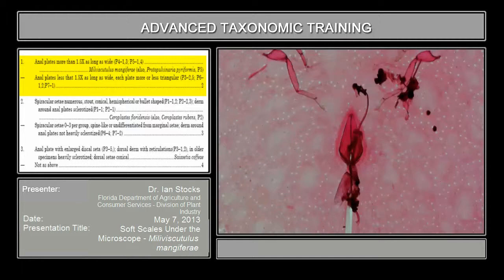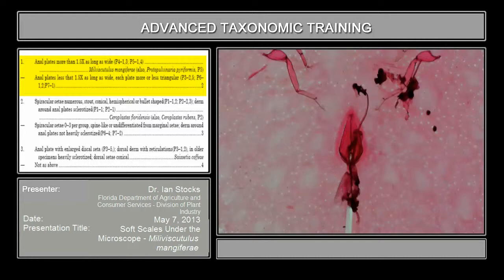The first statement in the key says: anal plates more than one and a half times as long as wide. So for this case, you're going to take basically this length here — the length of the anal plates compared to the width of the anal plates — and form an aspect ratio. This has got a fairly high aspect ratio; it's not really a simple triangle forming a quadrate structure. This is very exaggerated. So this corresponds to plate four, figure one, and figure three.